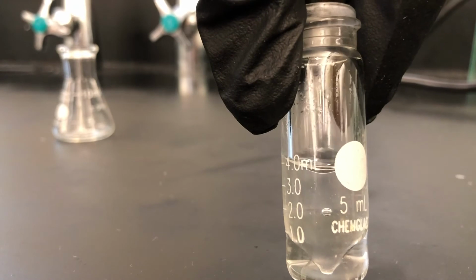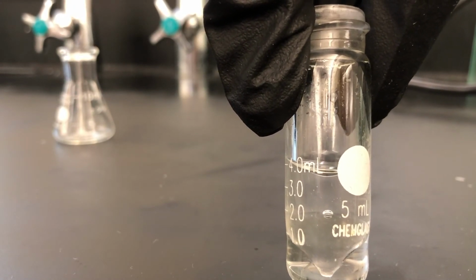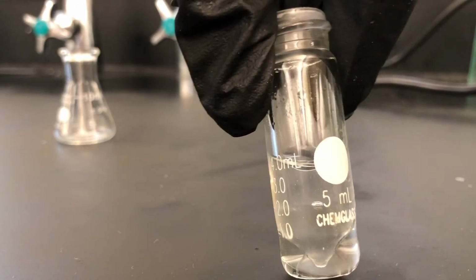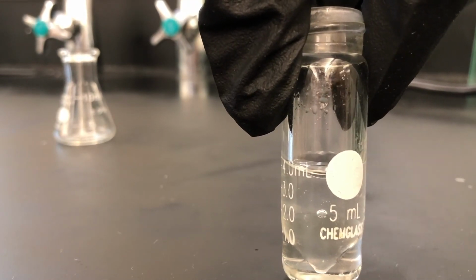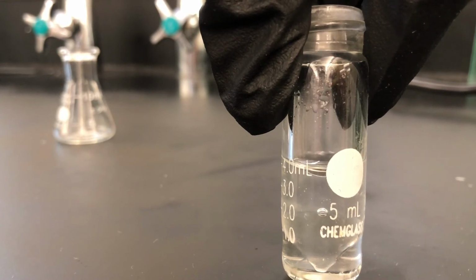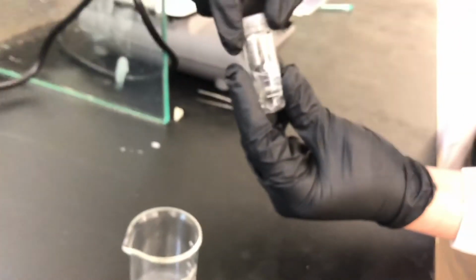So you can see the 2 layers, the top being the water layer and the bottom being the organic layer, right where that bubble is. And we want to keep the bottom layer, that's the one with the methylene chloride, that one has our product, the cyclohexanol. We're going to take the bottom layer and put it into the small Erlenmeyer flask.